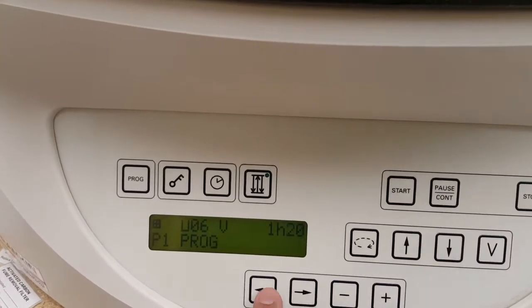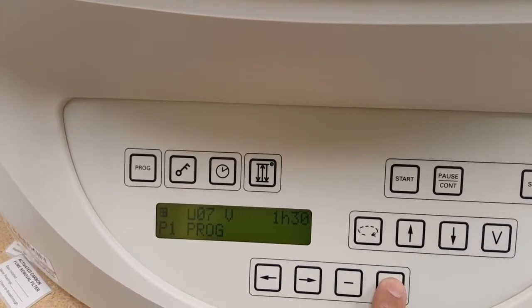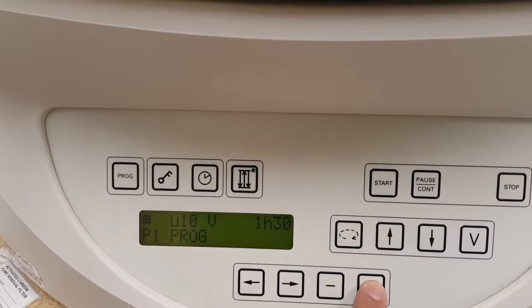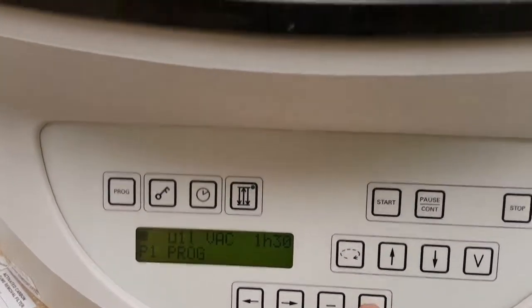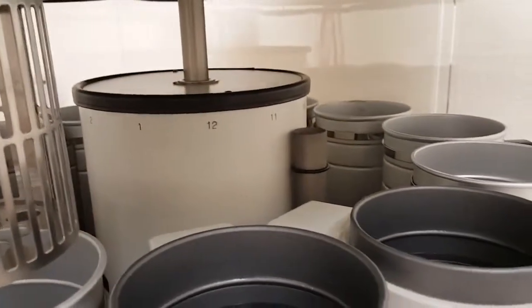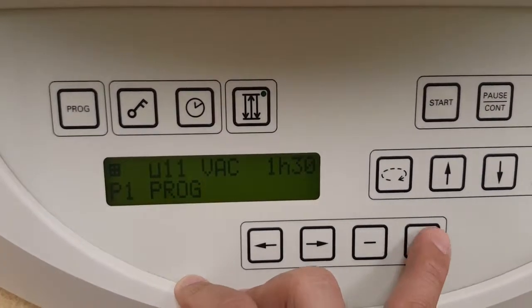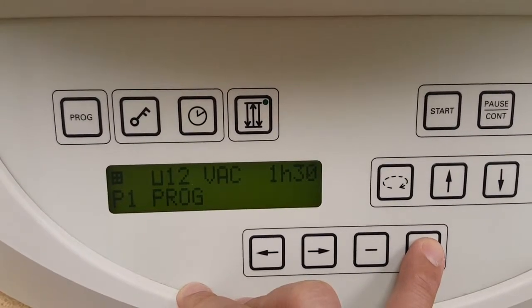Then we'll come back: seven, one thirty; eight, one thirty; nine, ten. Now eleven is your paraffin — the start of your paraffin bucket — so you can turn your vacuum on, which it is. Twelve, vacuum is on as well for an hour and thirty. You can't go any more than that because that's how many stations you've got.